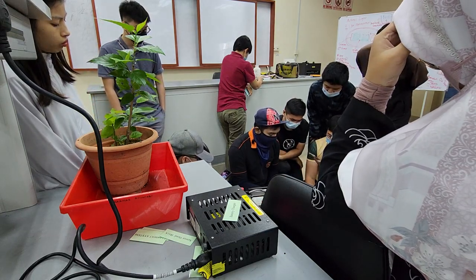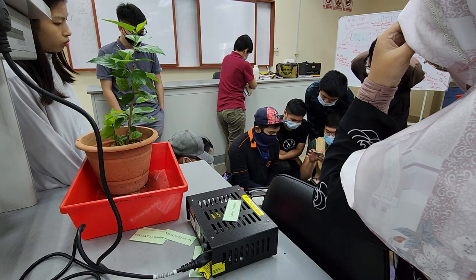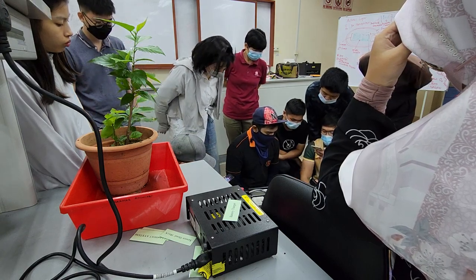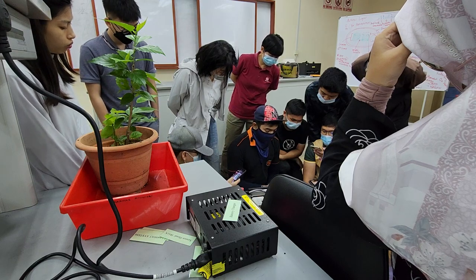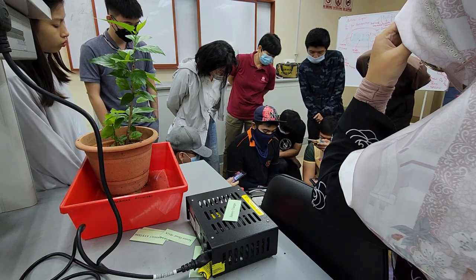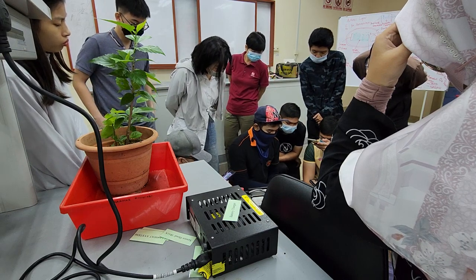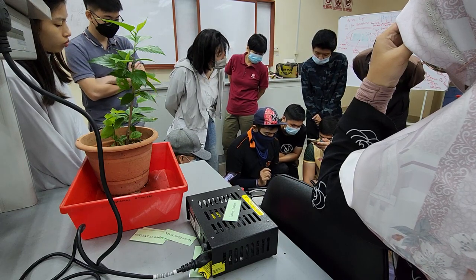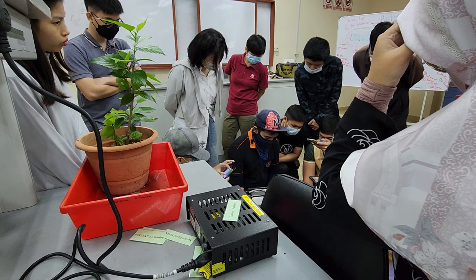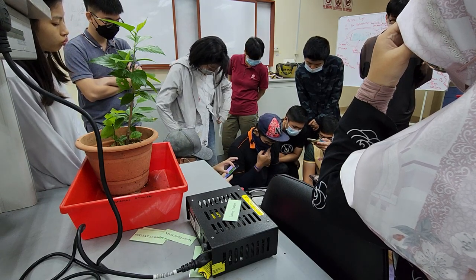Okay, fully scrubbed, pass. Okay, let's re-zero just for the CO2, F1. Press F1. So, before this, we did both for water and CO2. Now we know that water, no problem, just the CO2. We changed the CO2 scrub, we re-zero just the CO2 now.